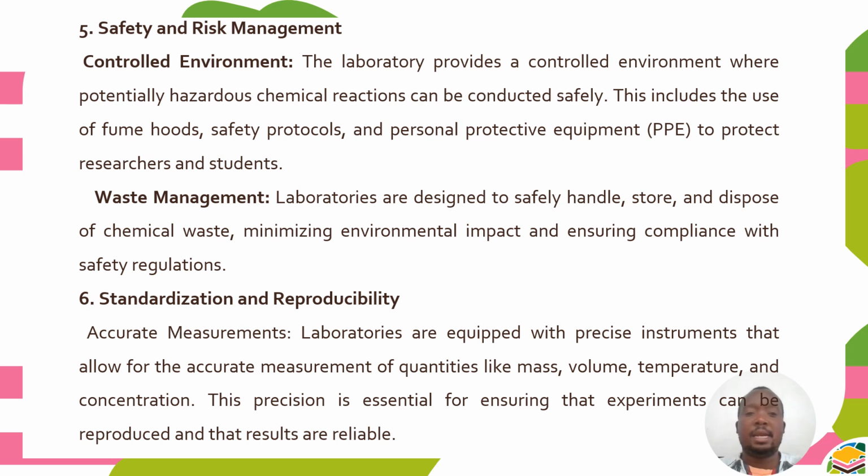Then safety and risk management. Controlled environment. The laboratory provides a controlled environment where potentially hazardous chemical reactions can be conducted safely. This includes the use of fume hoods, safety protocols, and personal protective equipment to protect researchers and students. Then there's waste management. Laboratories are designed to safely handle, store, and dispose of chemical waste, minimizing environmental impact and ensuring compliance with safety regulations.